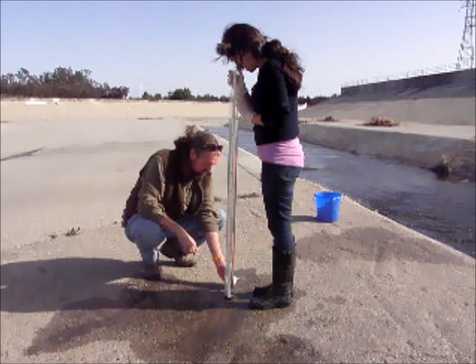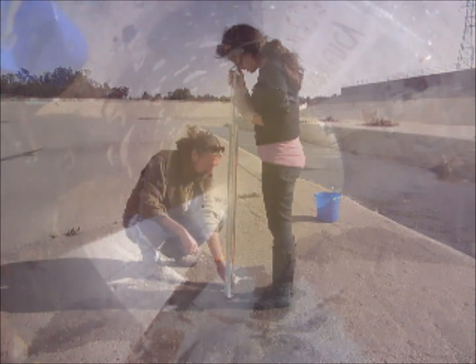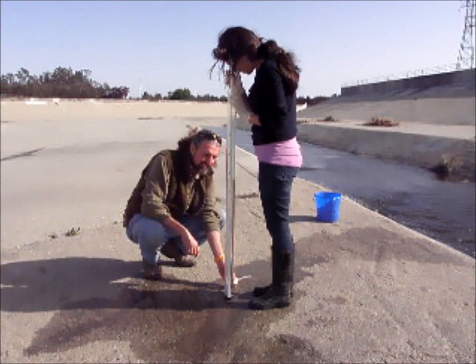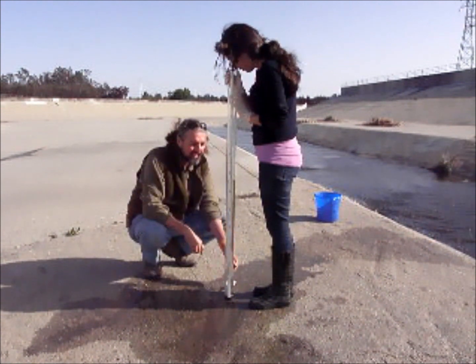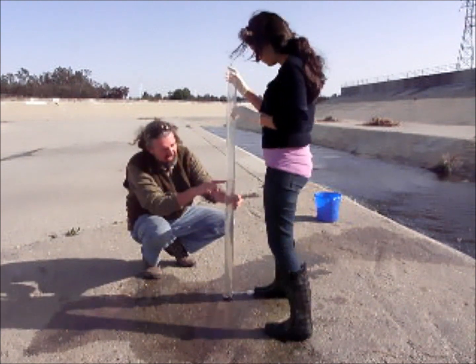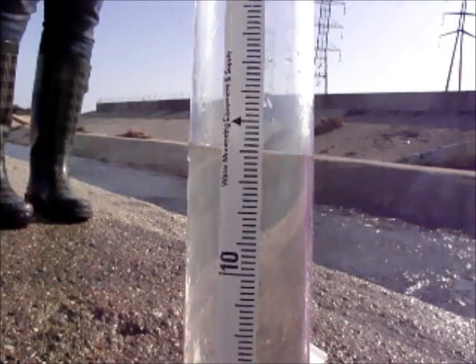Drain some of the water using the water release clamp and look down into the tube until the Secchi disk image becomes visible. When the Secchi disk image becomes visible, quickly shut off the draining clamp and then record your transparency tube measurement.